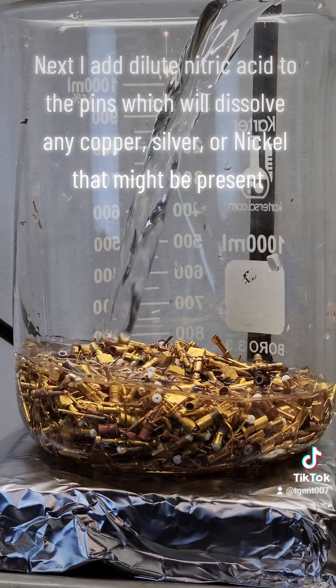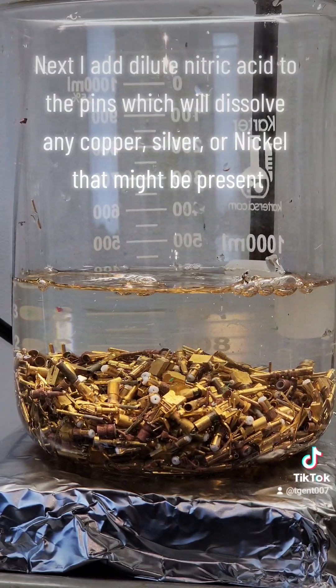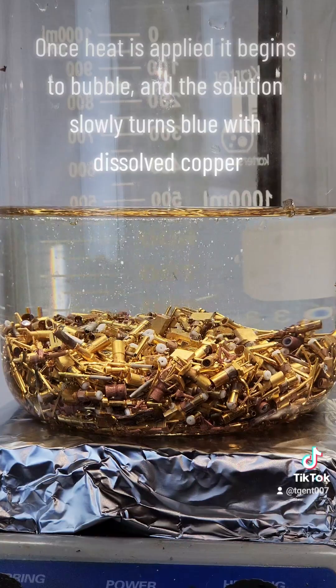Next, I add dilute nitric acid to the pins, which will dissolve any copper, silver, or nickel that might be present. Once heat is applied, it begins to bubble, and the solution slowly turns blue with dissolved copper.